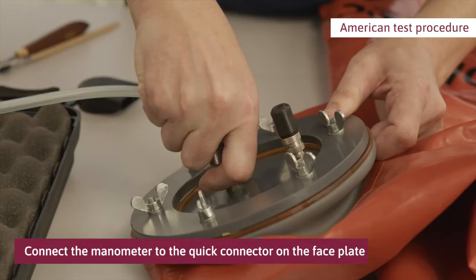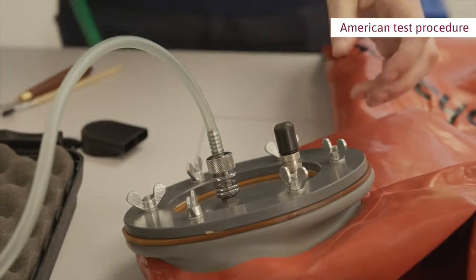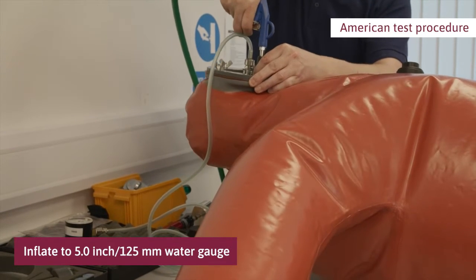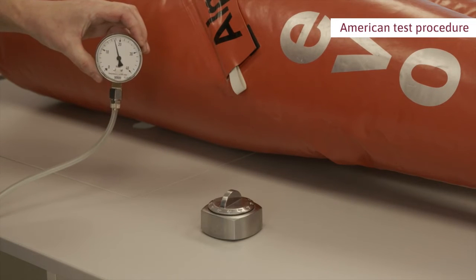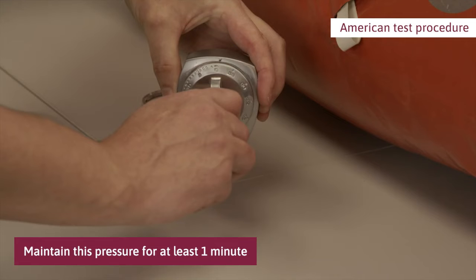Connect the manometer to the quick connector on the faceplate. Inflate the suit with an air pistol through the valve on the faceplate to a pressure of 125 millimetres water gauge. This is the pretest expansion pressure. Maintain this pressure for at least one minute in order to fill out wrinkles and allow the material to settle. Extend the time if air temperatures inside and outside the suit are not equal.